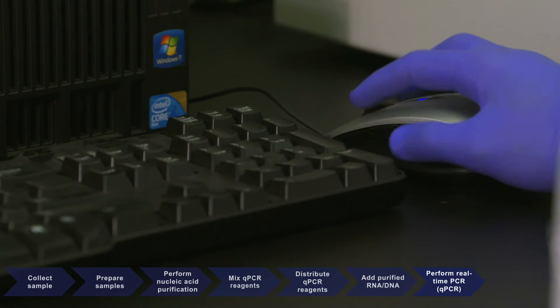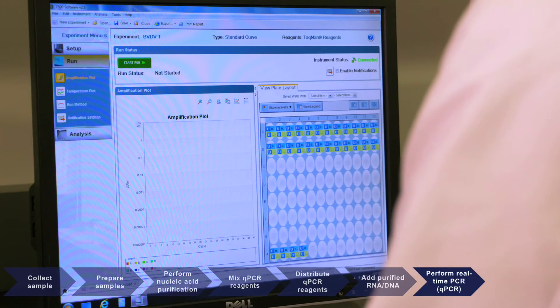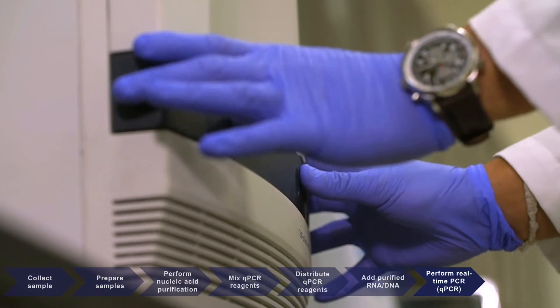Programming the instrument is intuitive and allows for flexibility to apply any run conditions necessary. Once the real-time PCR instrument is started, data can be collected and observed in real-time.